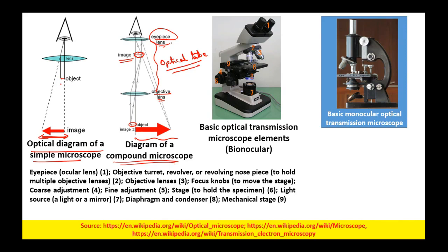In both the things, if you see, you have this object and the image has been magnified. In the second case, since there is a dual magnification, due to this dual magnification, the amplification or the magnification of the image is quite high. Okay.